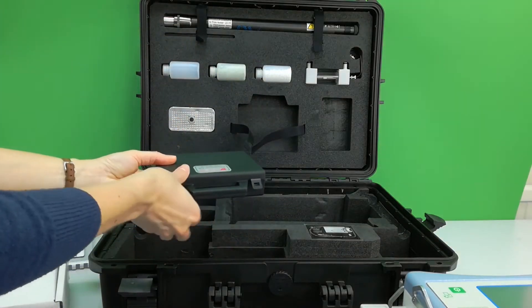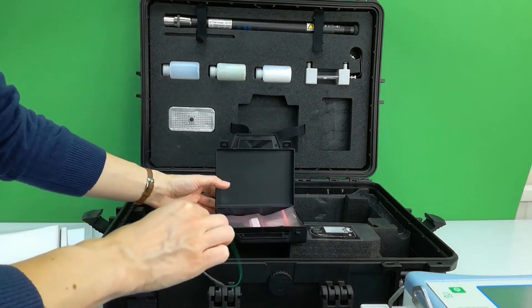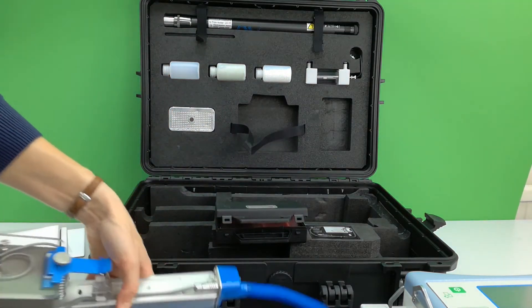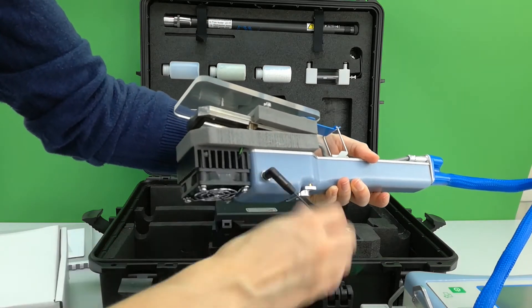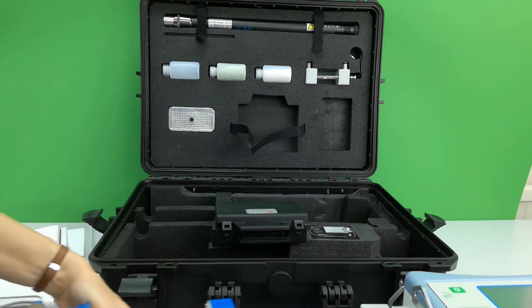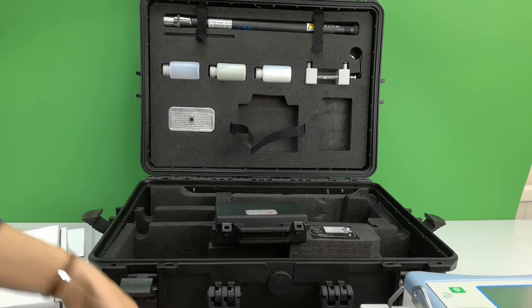A small tool kit is provided in the top of the carry case. The first item is a leaf thermistor. This is optional and attaches to the leaf chamber like so, and can be placed on any leaf within the chamber.